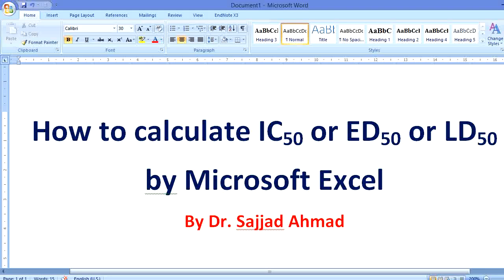Bismillahirrahmanirrahim. Today we are going to learn about how to calculate the IC-50, ED-50, or LD-50 by Microsoft Excel.